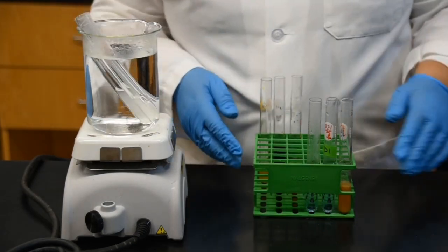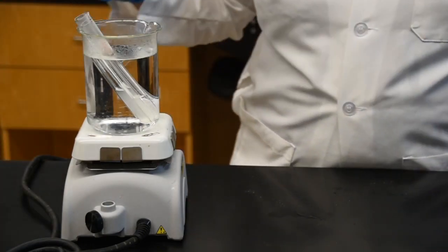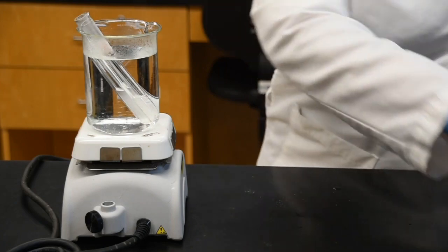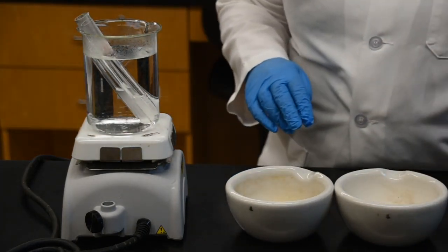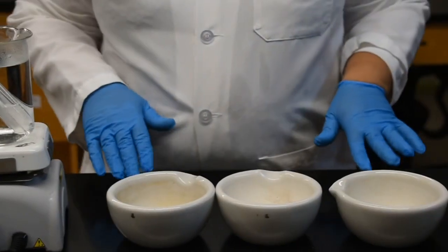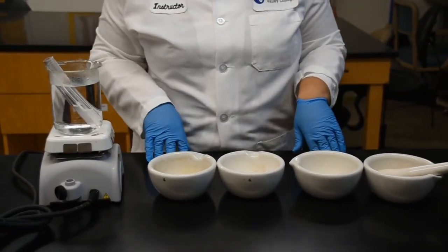While this is ongoing, I want to show you the setup that you are going to use to collect data for the experiment today. So right here, what I have is 4 samples of food, and we are going to test to see what each of these food samples contains.